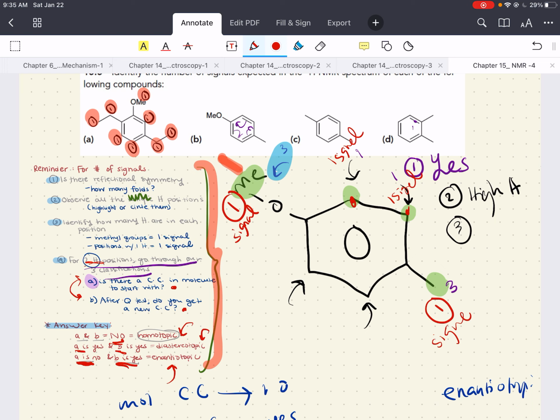So our molecule has no positions with 2 hydrogens for us to go through. So again, let's do a quick count. This methyl group has 1 unique signal. This has one, and this other methyl has 1. Our molecule has a total of 1, 2, 3, 4 unique hydrogen positions. So there's going to be 4 unique signals in our NMR.